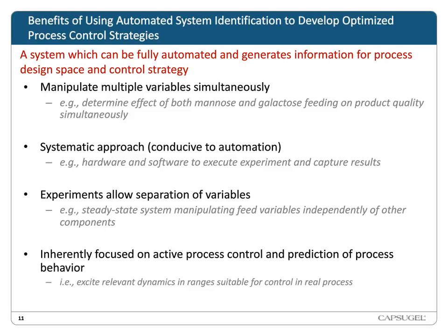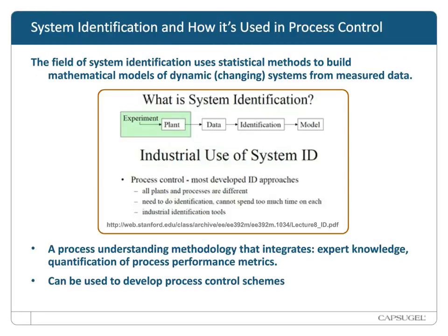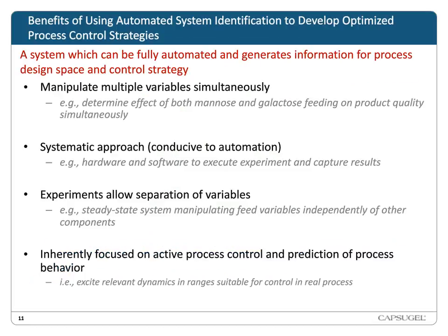So now back to the context of cell culture, using these system identification approaches to generate prediction of cell culture processes has many potential benefits. Firstly, system identification approaches typically do allow for multiple variables to be manipulated simultaneously in the experimental design. And that's the case even for complex systems. So this would obviously create a potential time savings, particularly for a highly multivariate system like a cell culture process, where we would ideally like to manipulate lots of different variables and see what their individual effects were on the process outputs.